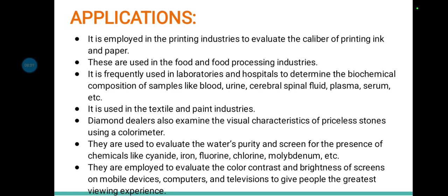Then they use it to evaluate the water's purity and screen for the presence of chemicals like cyanide, iron, fluorine, chlorine, molybdenum, etc. They are employed to evaluate the color, contrast and brightness of screens on mobile devices, computers and televisions to give people the greatest viewing experience.